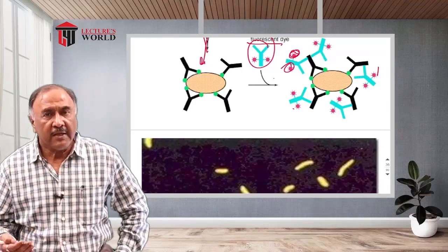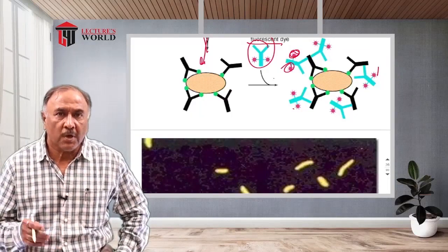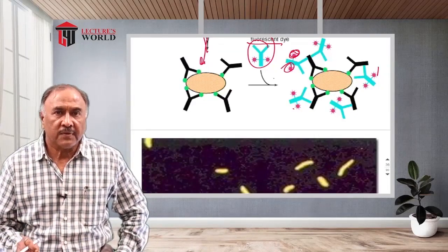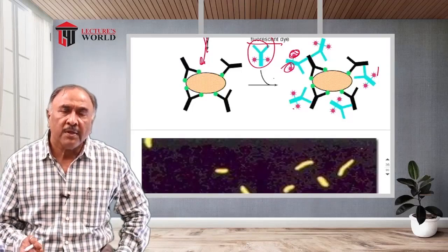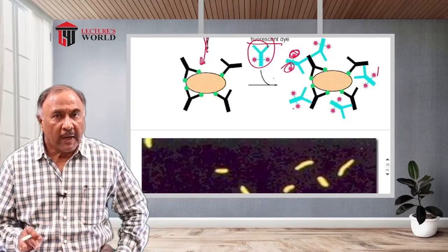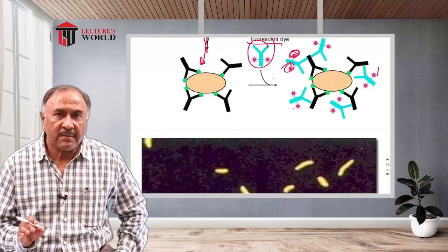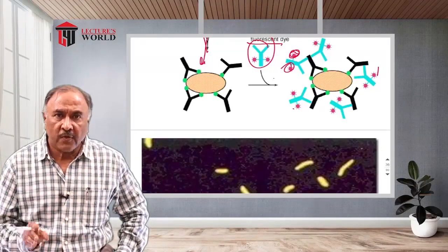Finally, these all together would lead to a characterization. In certain additional cases, this characterization is confirmed by using serological methods. These are all considered classical laboratory techniques for identification.